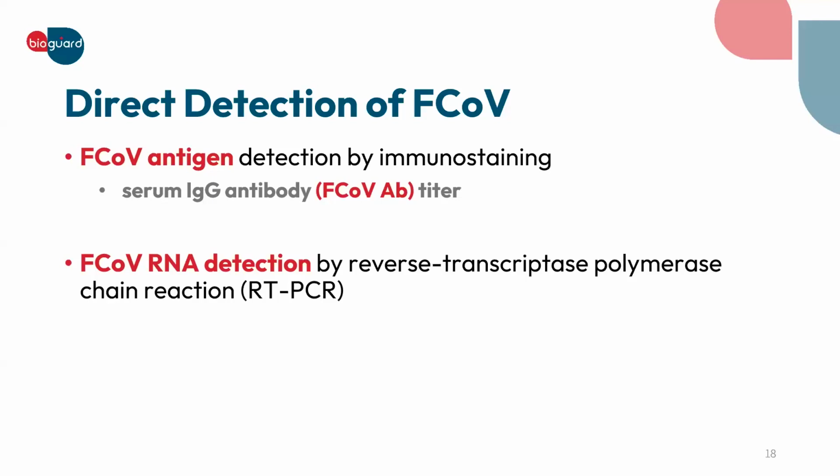Since I mentioned in the beginning that FCoV is an RNA virus, not a DNA virus, this kind of PCR has to make sure that the methodology adopted has a reverse transcriptase enzyme that can convert RNA into DNA first and then do the PCR normally, whether it's a real-time PCR or a conventional PCR, that's fine. However, we have to make sure that it's a reverse transcriptase polymerase chain reaction.